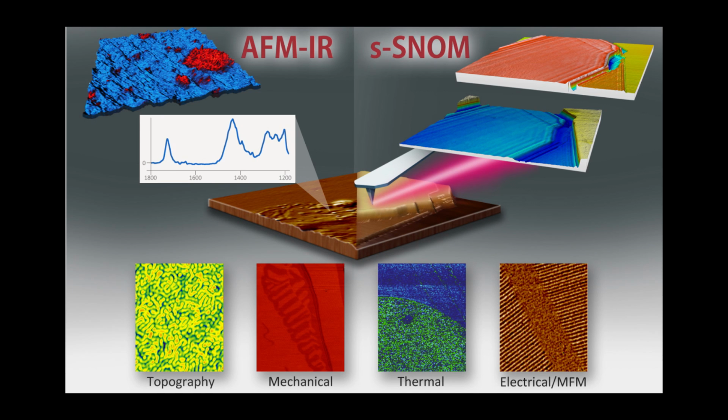Now, typically, that's reasonably straightforward with a biological sample. If it's a collagen fiber, you just deposit it onto a substrate, and the fiber in and of itself is thin. Or if it's a bacterial membrane, again, the exact same thing. So the challenge is more typically if you're looking at a tissue sample, then a tissue sample would need to be sectioned and deposited onto a substrate.